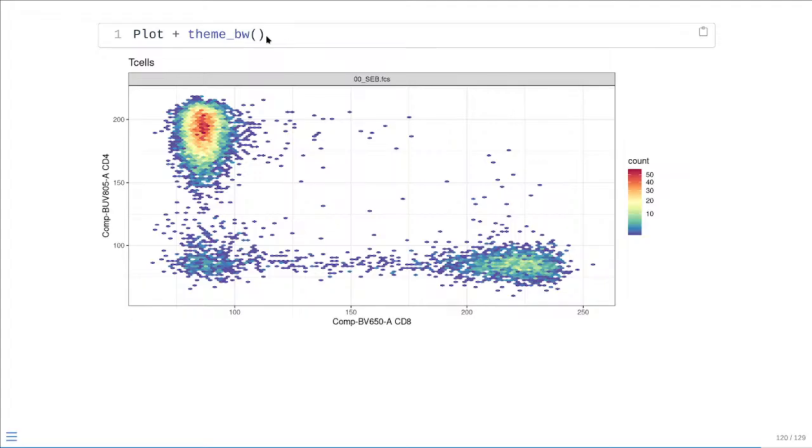If there's something that doesn't work using ggplot2 directly on ggcyto, oftentimes if you convert your ggcyto object into an actual proper ggplot first, then you can actually come in and do all the customizations that you may want. And we'll look at that more over the next couple weeks as we start visualizing flow cytometry data regularly, about the customizations we can do.